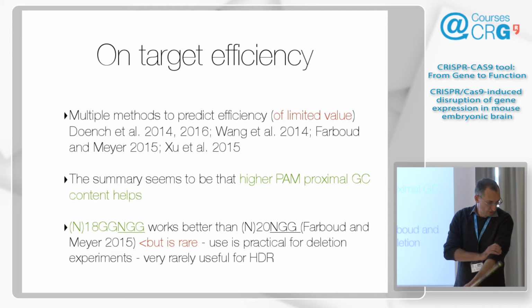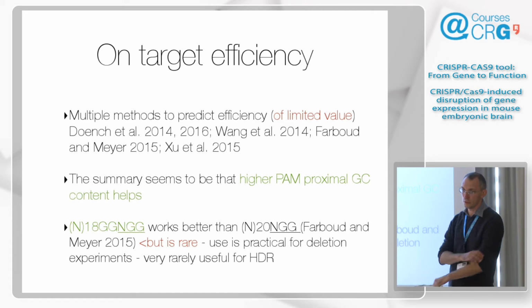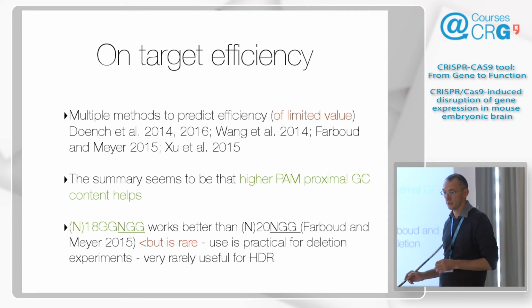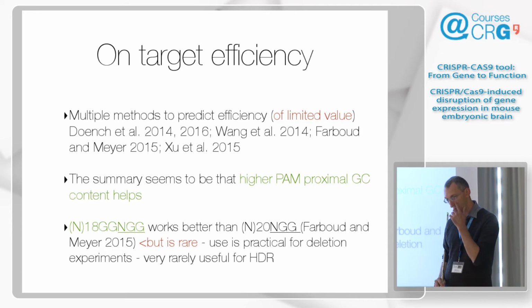So in terms of on-target efficiency, when you're designing your experiment, you could pay attention to one of the many different sites and algorithms that allow you to predict the on-target efficiency.